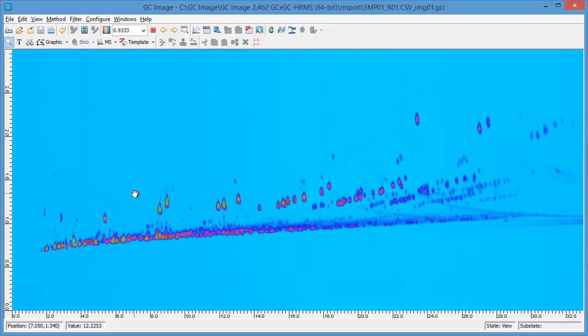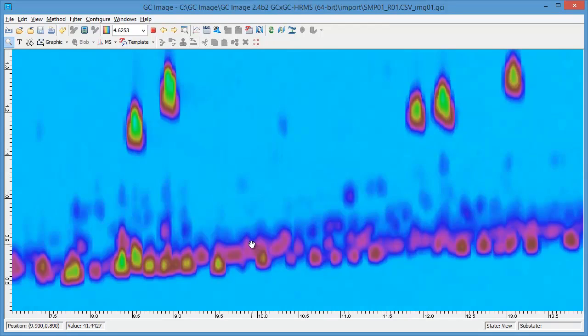In view mode, the analyst can pan or scroll across the image by click and drag with the mouse left button. In view mode, to select a region for viewing, click and drag with the mouse right button. Then, the selected region is resized to create the new image view. This resize operation changes both the scale and the aspect ratio so that the indicated region fits the viewport.